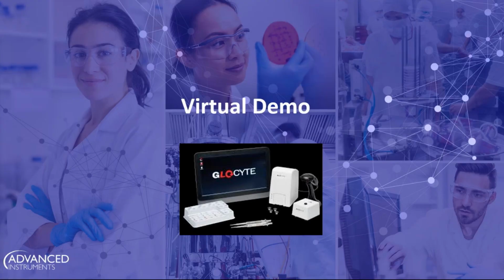And the last thing that I just want to reiterate that Jordan shows is that dilution process. I talk with hospital labs all the time, especially with CSF. The dilution process is ultimately the hardest part. You have to try to figure out, okay, I have a really bloody sample. Is that a 1 to 100 dilution? Is it 1 to 10? What do I do? And different techs are different, right? The GloCyte will look at those results and take the guesswork out and recommend the correct dilution to use. And once again, streamline that process.